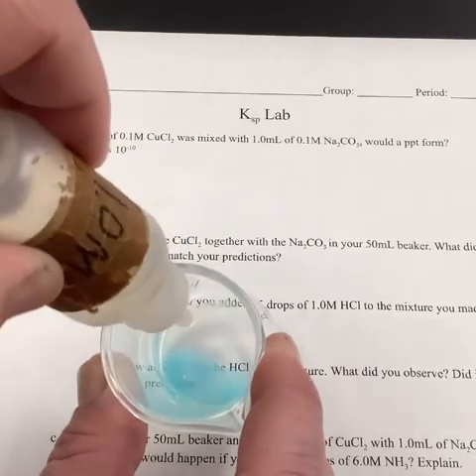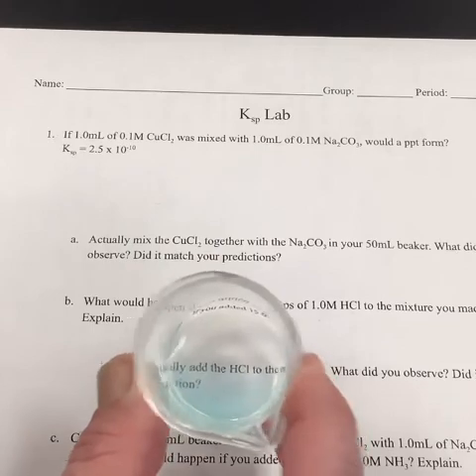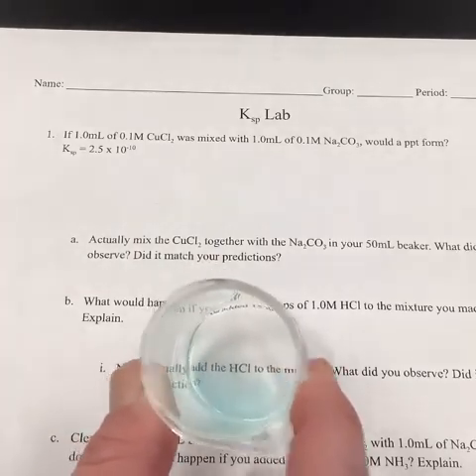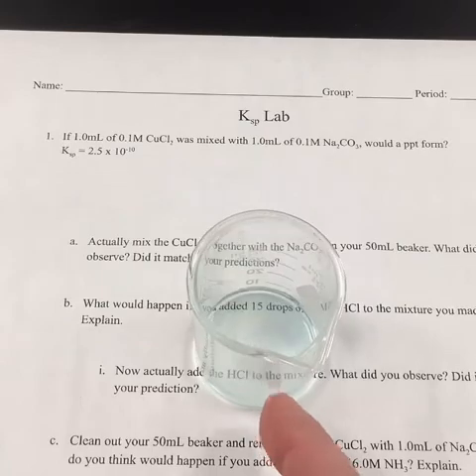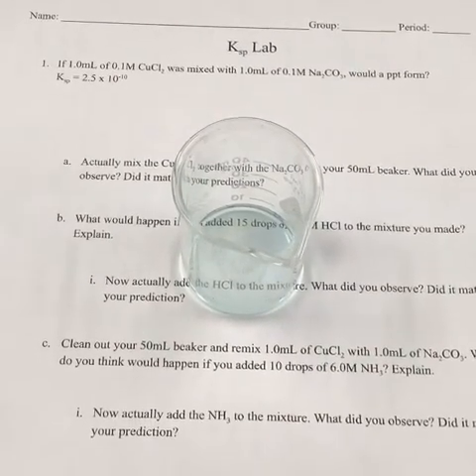All right, what's happening here? So adding the HCl, looks like it dissolved the precipitate. It made it more soluble. Right. So we've pretty much finished number 1, A and B.